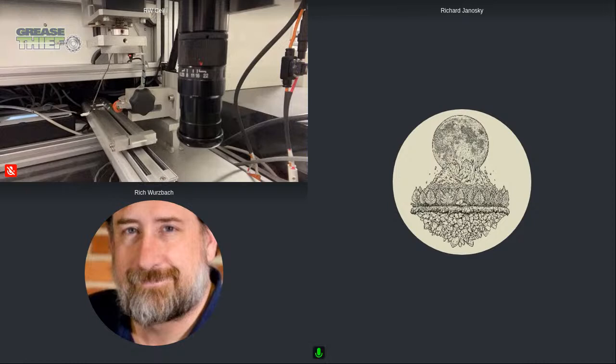Yep. And that's the nice thing, it automatically resets to the same home position on the actuators. So once that is set, you don't have to change anything, and there's not a button that you have to hold or anything. You just hit a button, and it returns back.